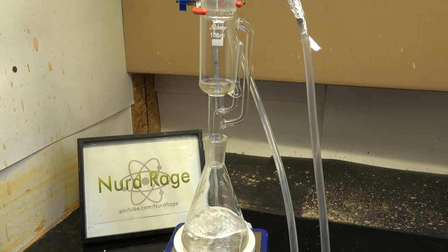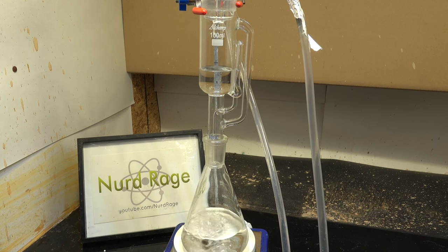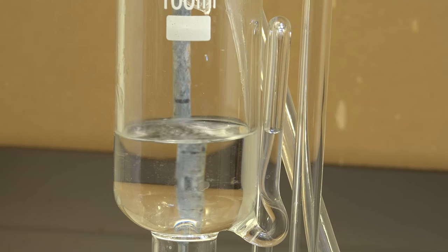As you can see, the vapors rise up through the outer tube and condense inside the extractor. Any chemicals would get dissolved, and as the extractor fills, it eventually overflows and the siphon tube pulls out all the solution. The process repeats without any intervention, and you can leave this running indefinitely. Let's see that again, but this time close up.